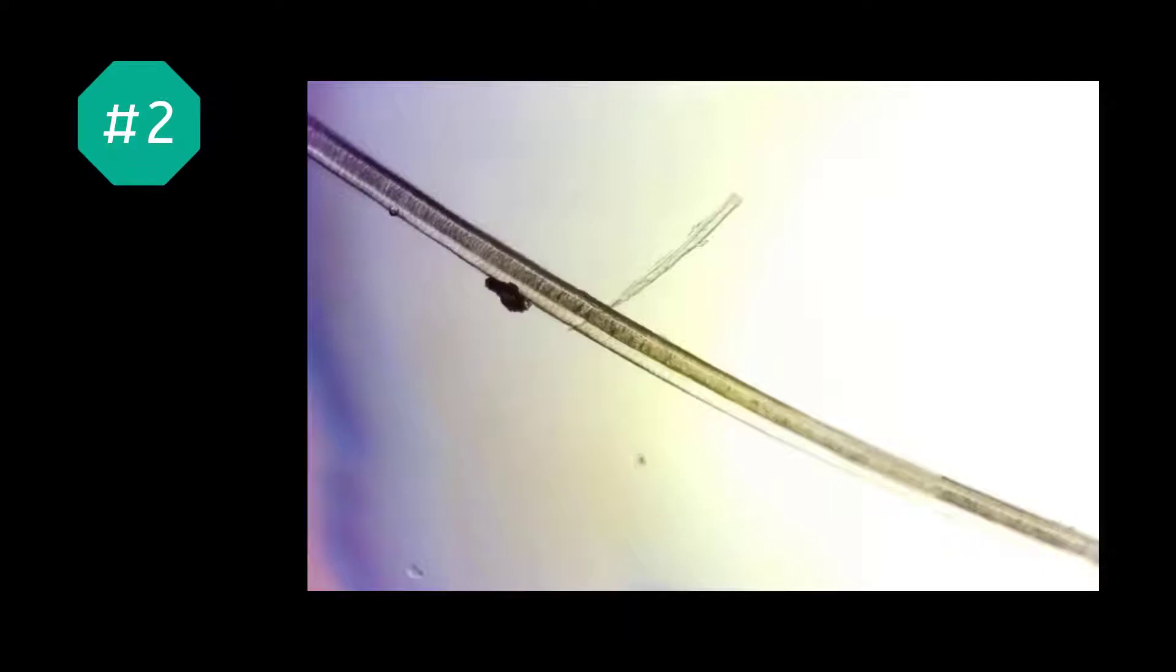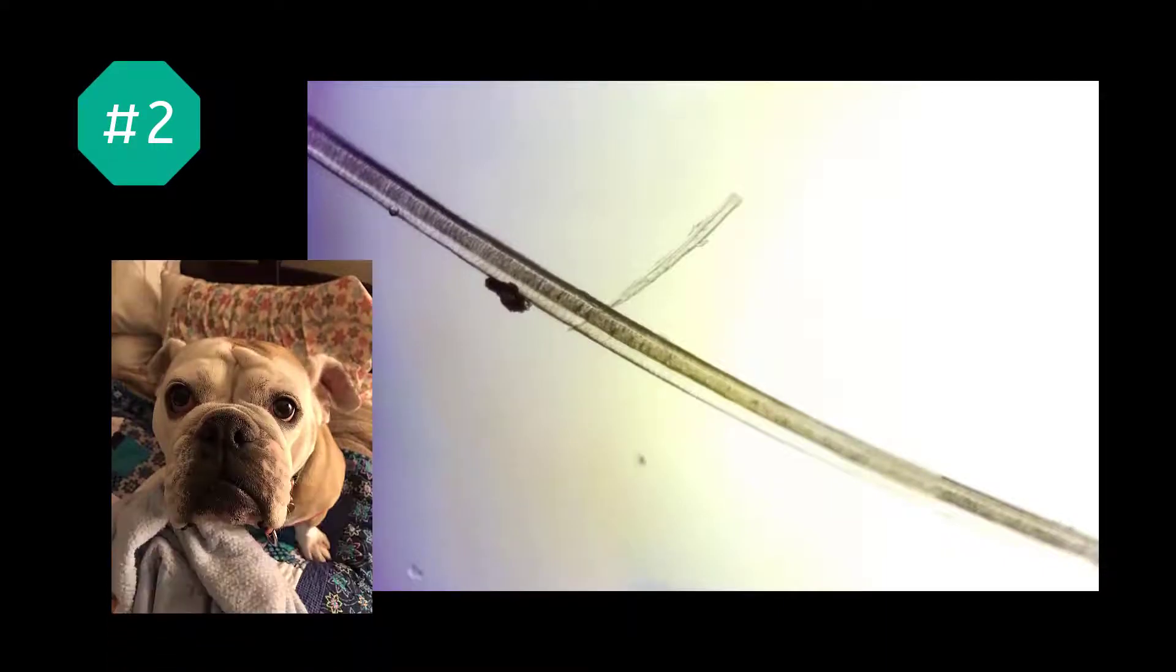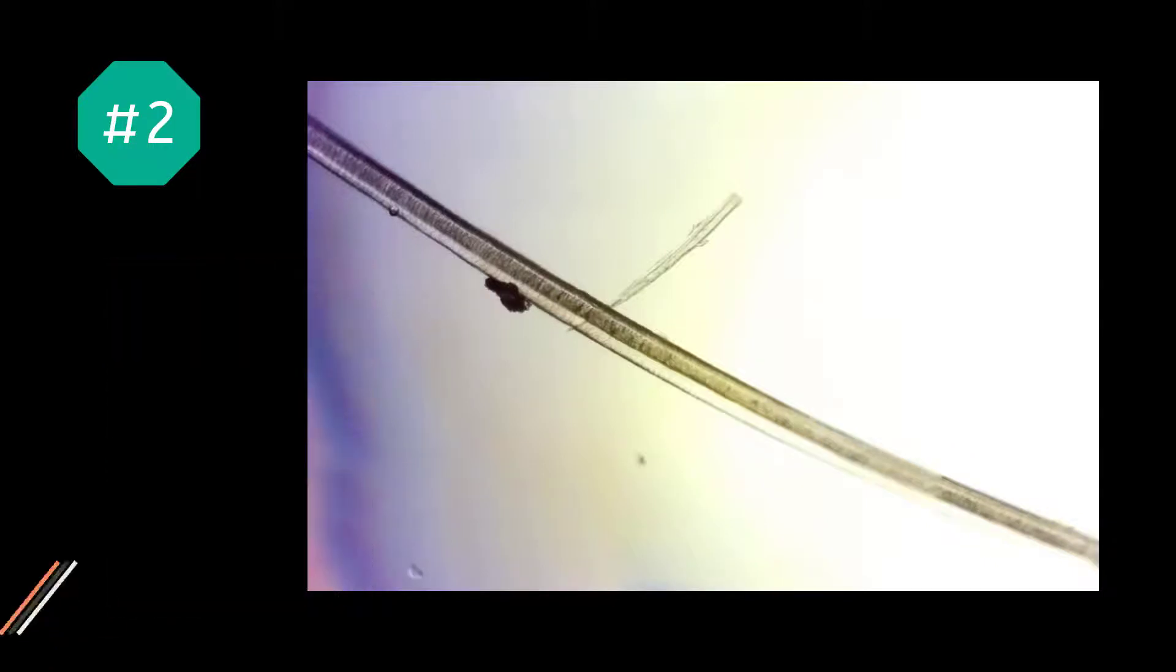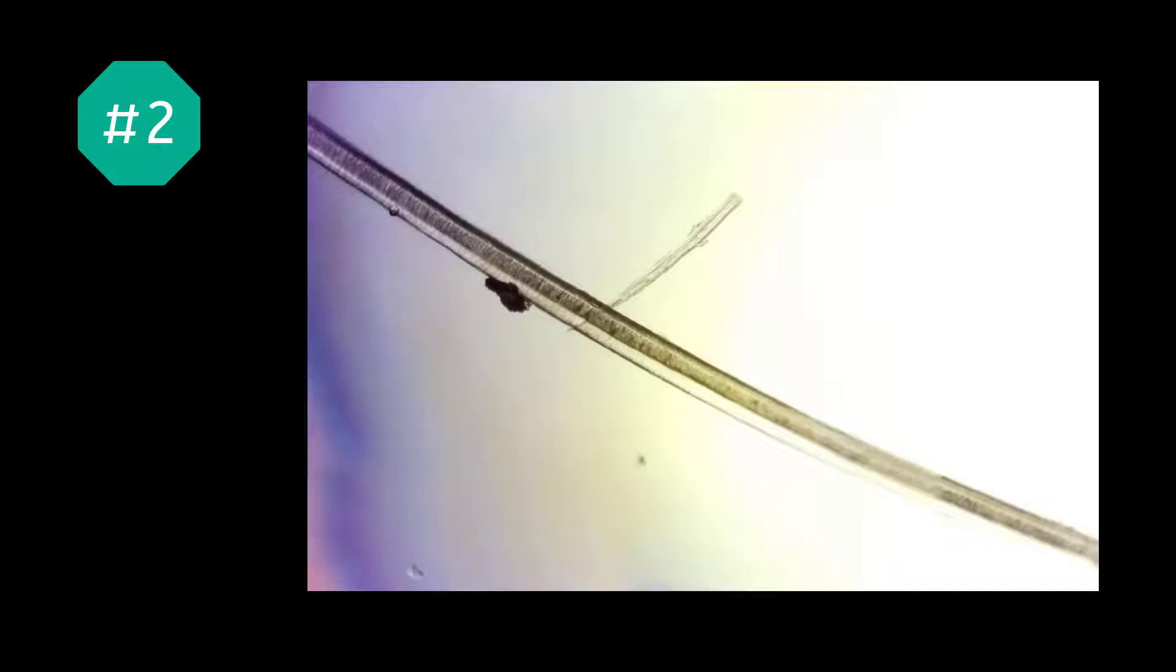And number two. What is it? Bulldog fur. And is that a sliver in her fur? I was surprised to see a pattern on the fur, and I'm curious what it will look like at even higher magnification. A future video, perhaps?